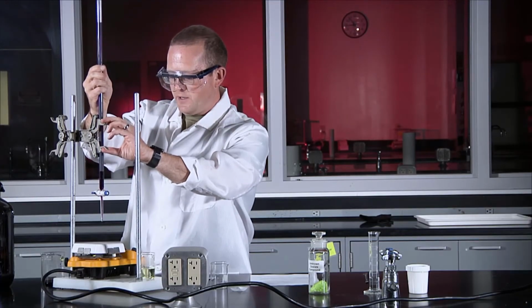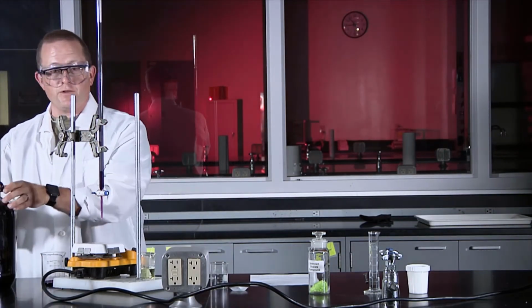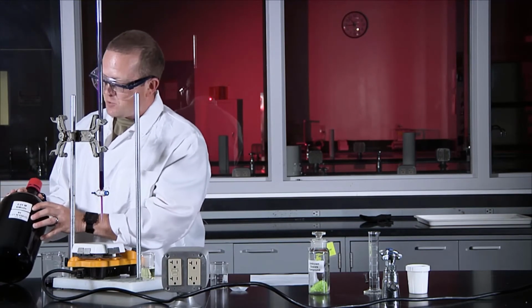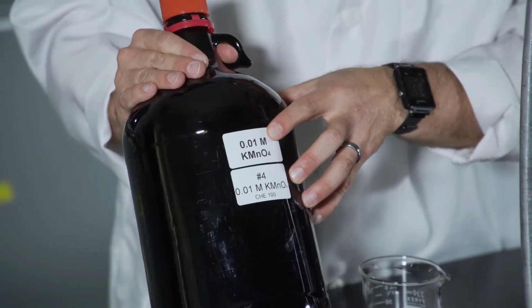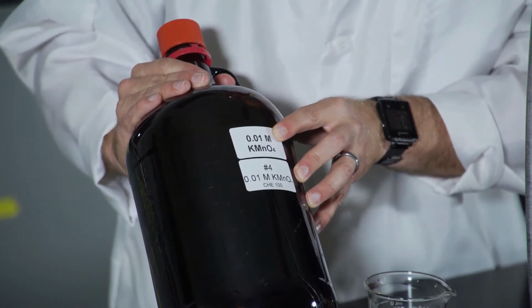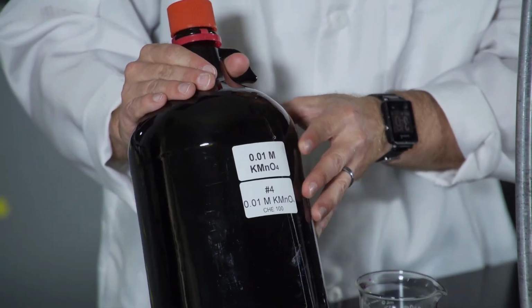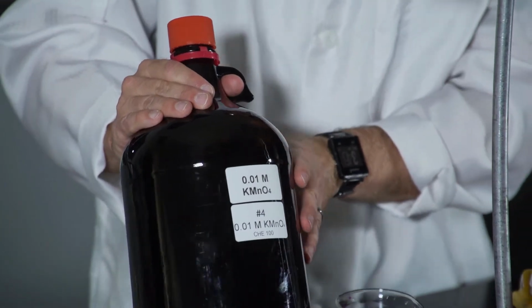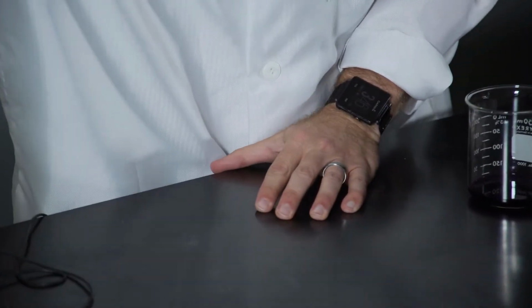Okay, so we'll put it back on here. It's also very important for this experiment to note the concentration of the potassium permanganate that's written on the bottle. In this case, it's 0.01 molar, but it might be slightly different in the one that you use when you're in the lab. Set that aside.